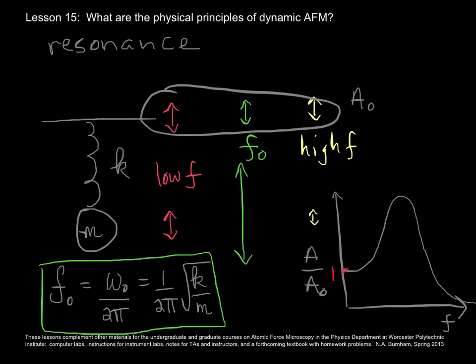So here is f0, and the region up to the right, this is what I was indicating by a very small response at high frequencies.